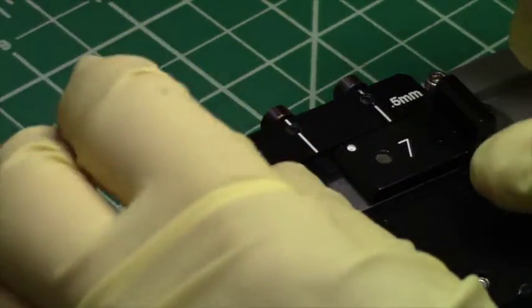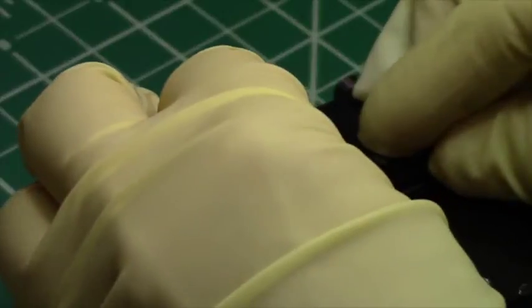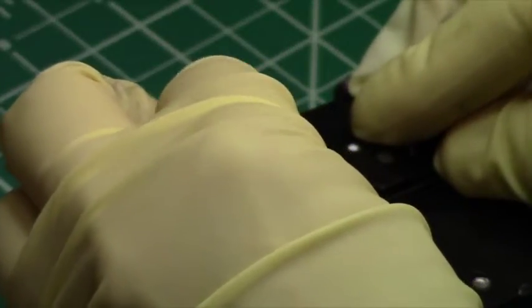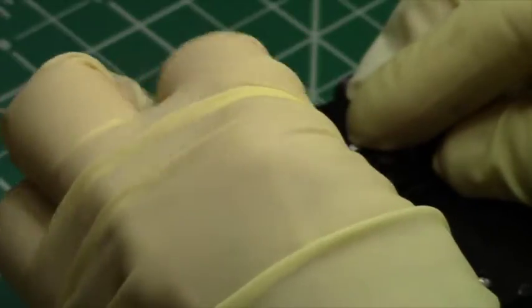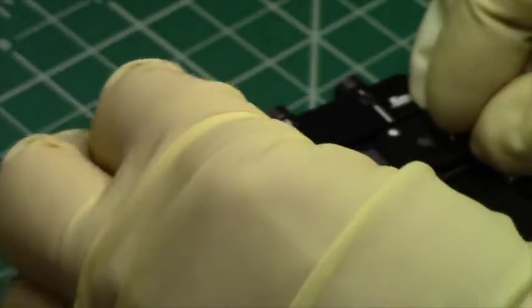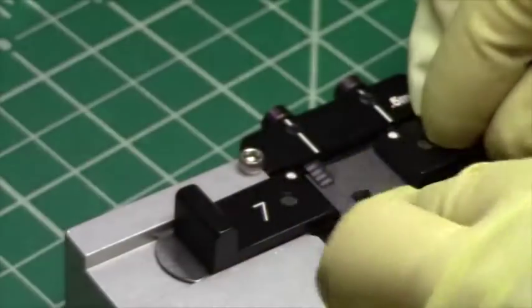Now that the sample has the indent aligned with the white line over the pin, I'll push gently on the white dots and you'll see that the sample has cleaved.